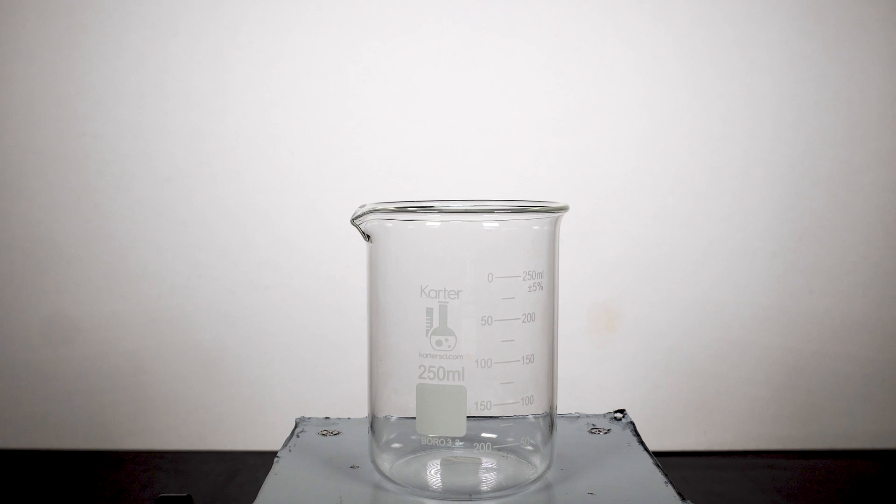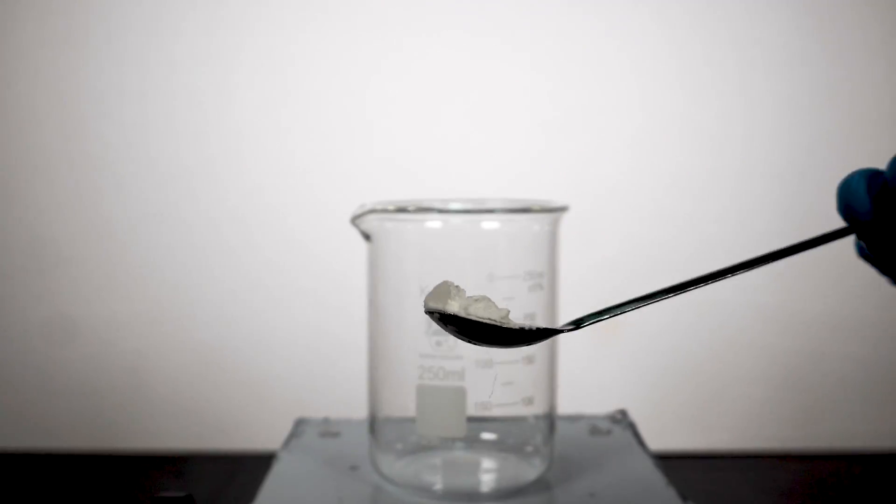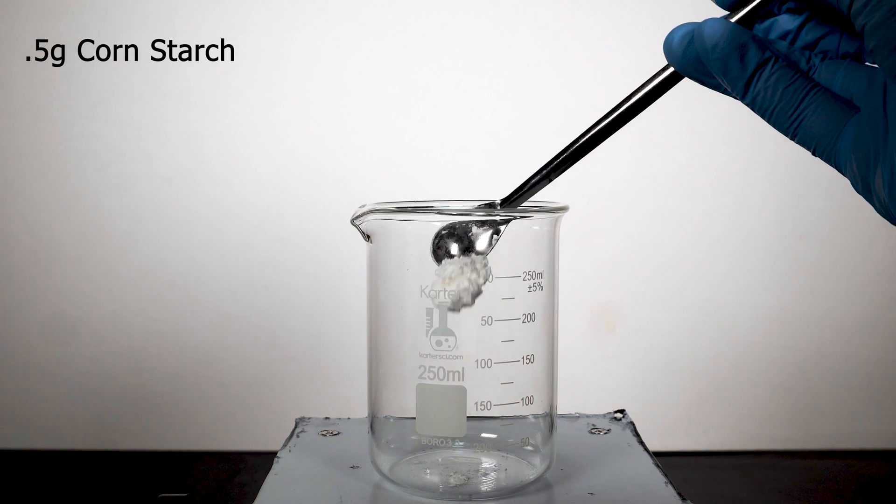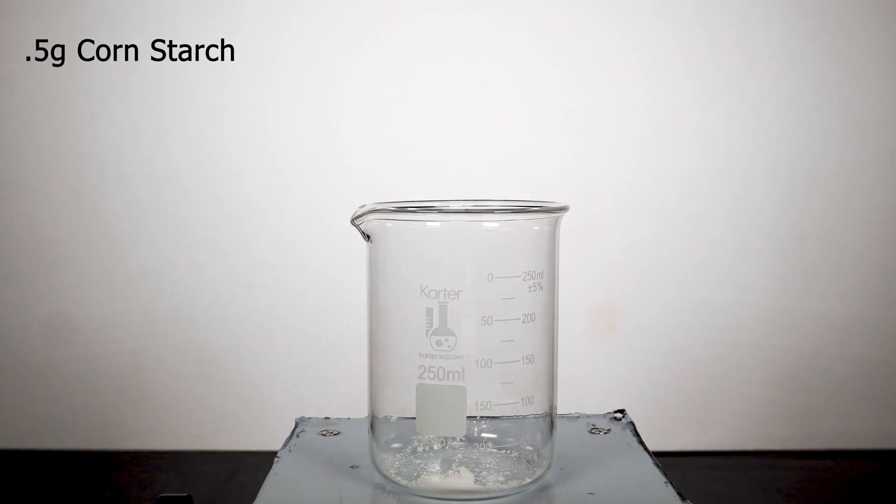The next solution consists of water, cornstarch, and hydrogen peroxide. The first thing we'll need to do is add about 0.5g of cornstarch to a beaker. Too much cornstarch, and your clock reaction will take a little bit longer to make its final complex, but this isn't always a bad thing.